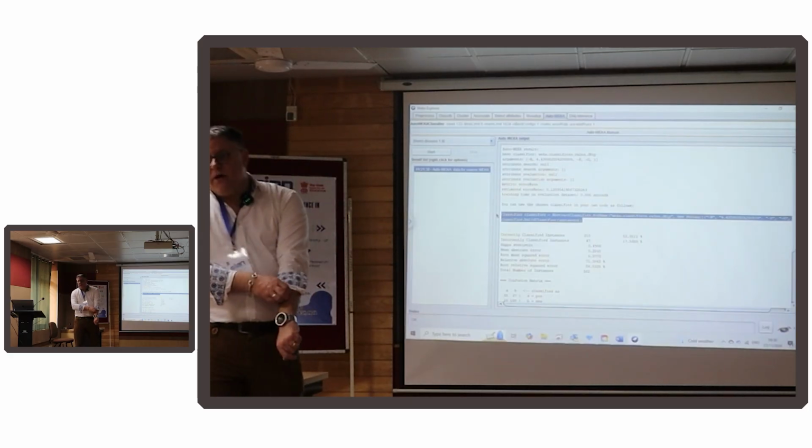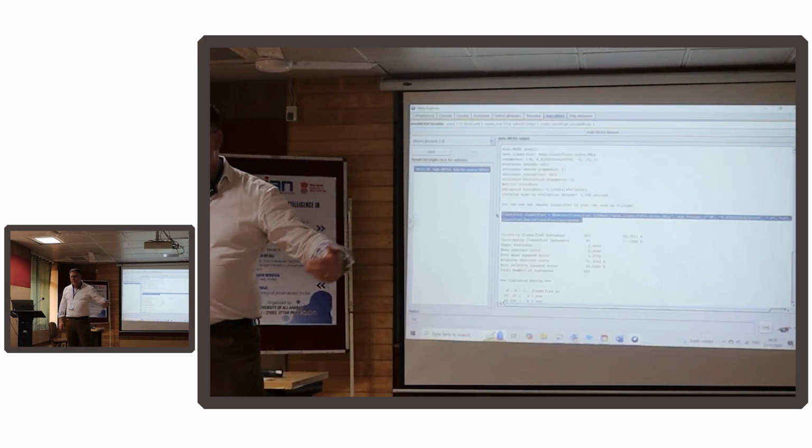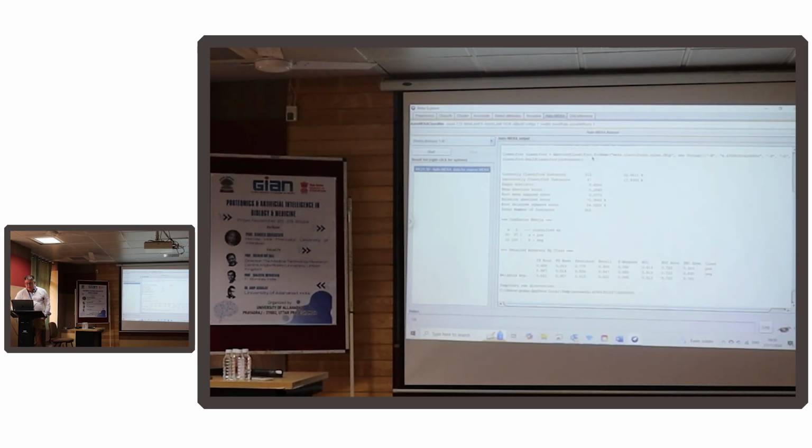That will set it up, as long as the right libraries are in place in Java, and run that same algorithm, so I could put it into an algorithm for somebody else to use. It gives me the usual metrics, classifier rate, and correct cases: 215 correct, 47 incorrect. So that is an improvement on what we had before.